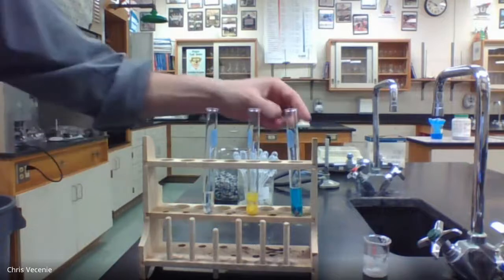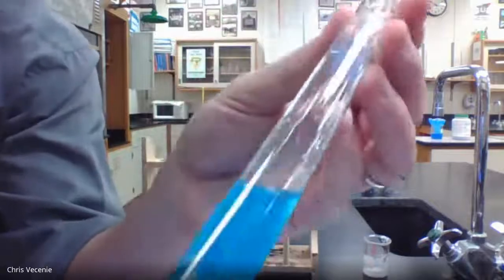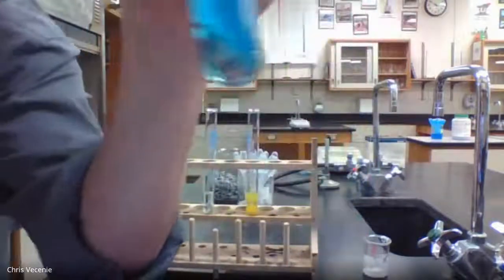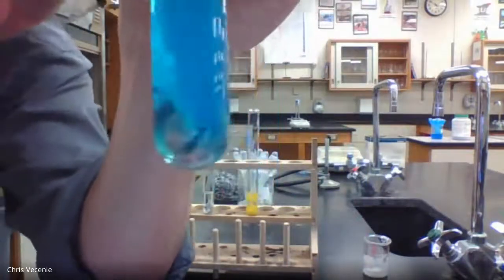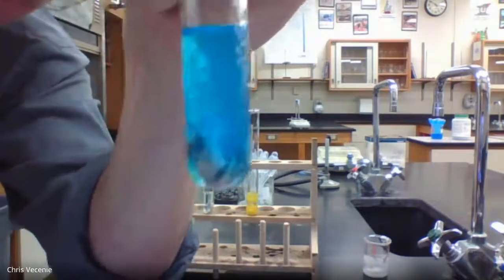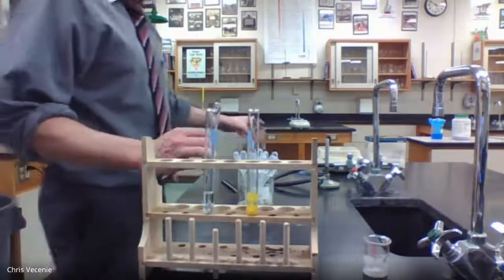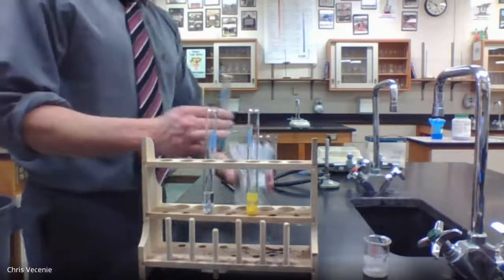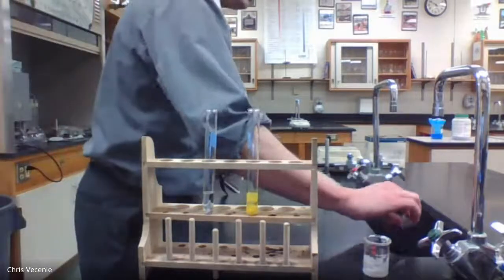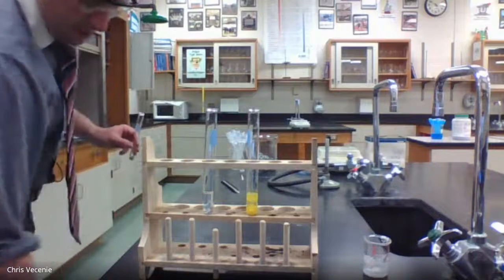The last thing we need to do is make our observations on our first test tube. Now, you can still see we have the blue clear liquid in it. Clear because you can see through it. You can see my arm behind it, but still blue. What we're going to do is dump off that blue and see what the metal looks like now. So there's the blue. Get a pair of tweezers.